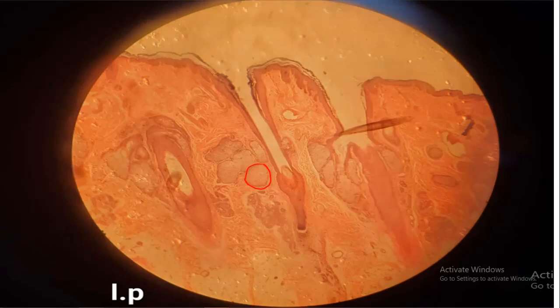In practical number 2, you need to see the sebaceous glands, and what will make you see them is their prominent nuclei. The nuclei are what make these sebaceous glands so prominent and viewable using a light microscope. So you need to draw the cells of the sebaceous glands.